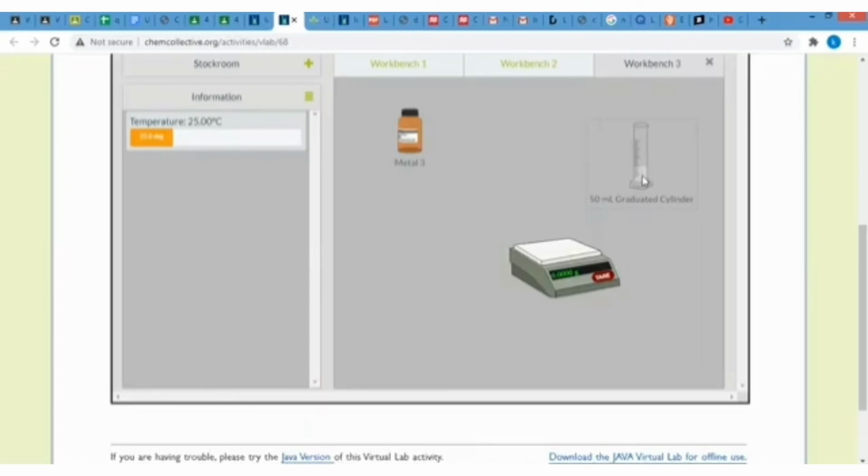So now we're finding out what's the mass of the metal number 3. So from a mass of 71.4421 grams, there is a big increase to 415.1907 grams. This is because metal number 3 was added.